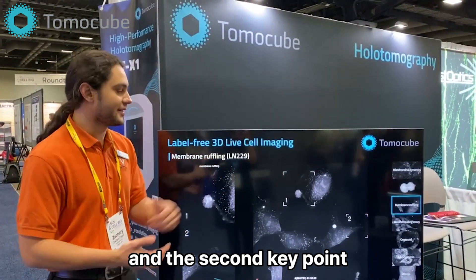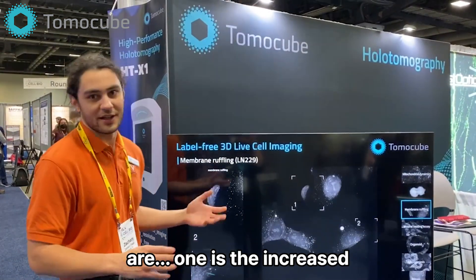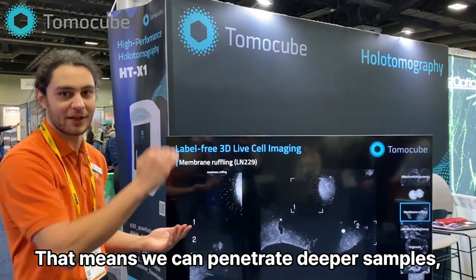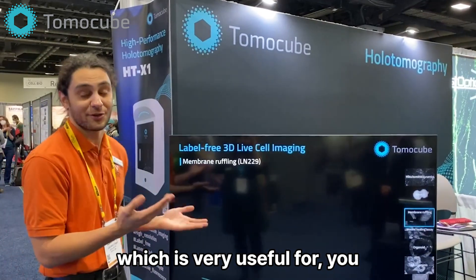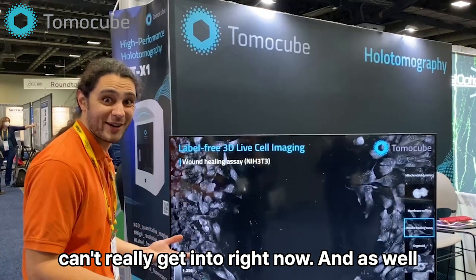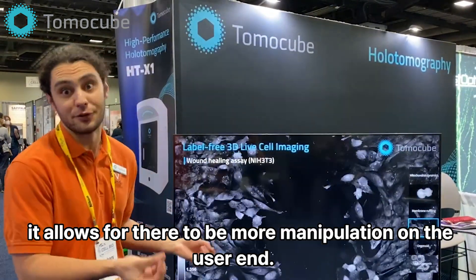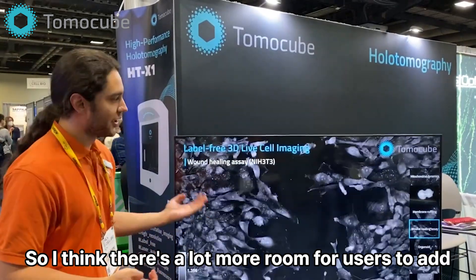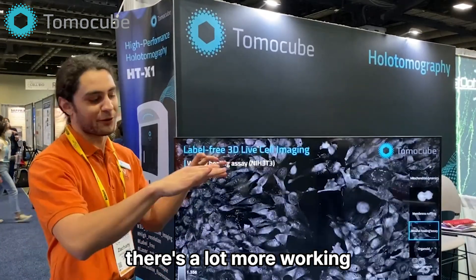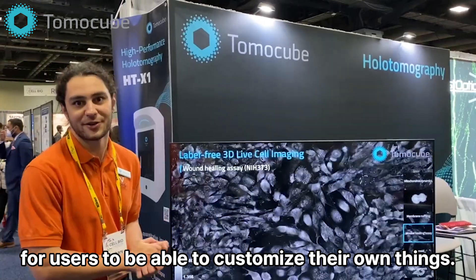The key points I really like about the system: one is the increased working distance, and the benefit to that is actually twofold. It means we can penetrate deeper samples, which is very useful for a variety of applications that our competitors can't really get into right now. It also allows for more manipulation on the user end — there's a lot more room for users to add things like microfluidic channels, and a lot more working space around the actual optics for users to customize their own things.